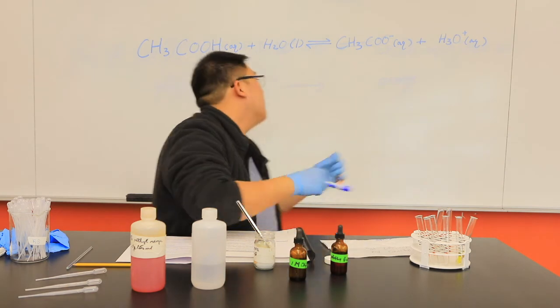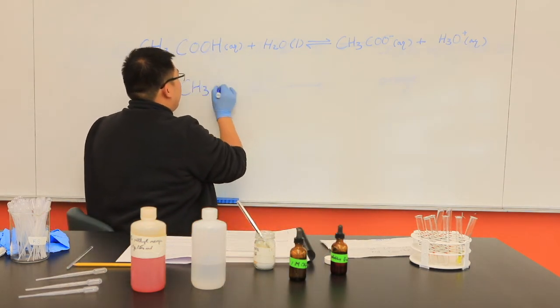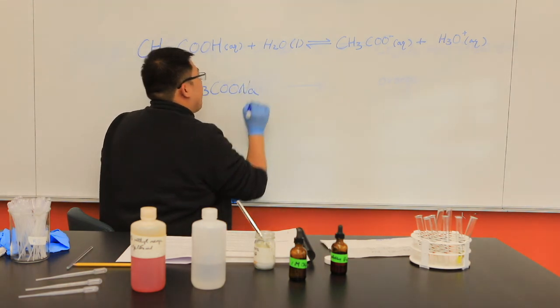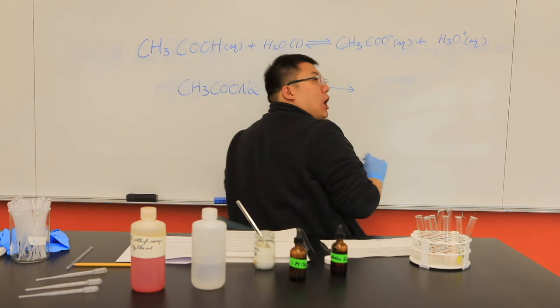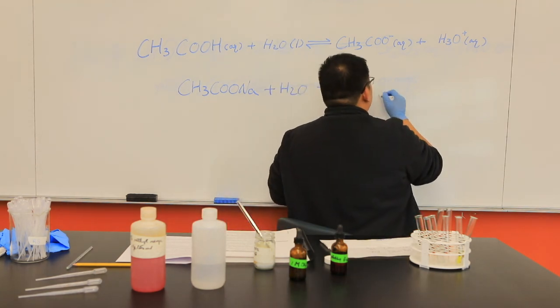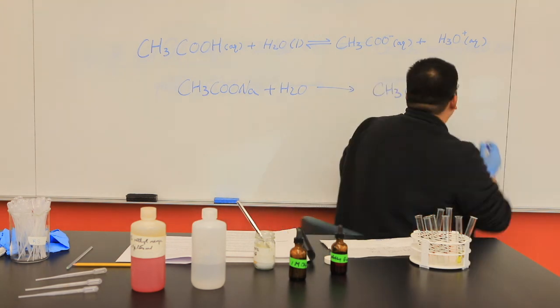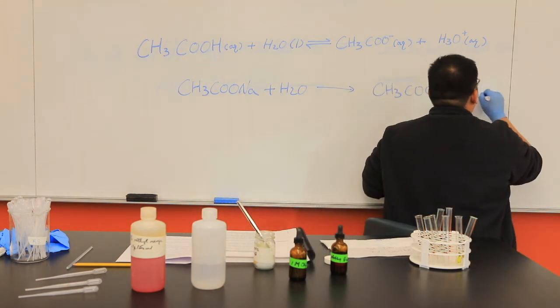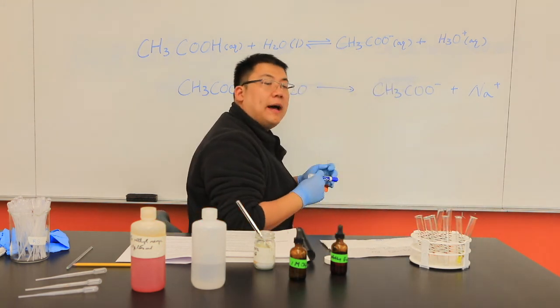This is the formula of sodium acetate. When this is added to water, it will completely dissociate into acetate anion and sodium cation.